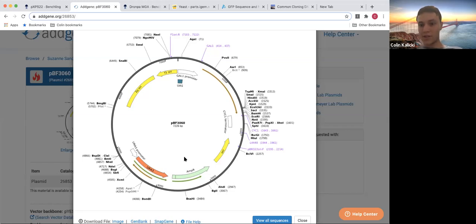Yeah, they're selection markers. Very good. And exactly what Arthur said too. You want to test which one's actually transformed. So let's say of E. coli, you're going to introduce this in. They're going to repeat it, central dogma it, and produce ampicillin resistance. Then I'm going to introduce my petri dish of them to ampicillin. I can see how effective my transformation was. And that's what a selection marker is.